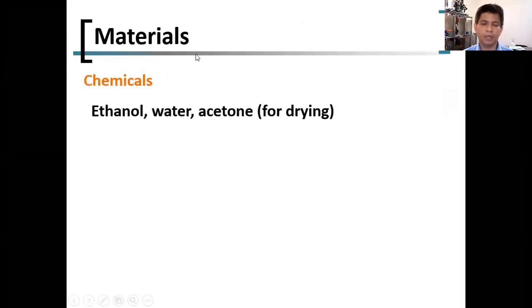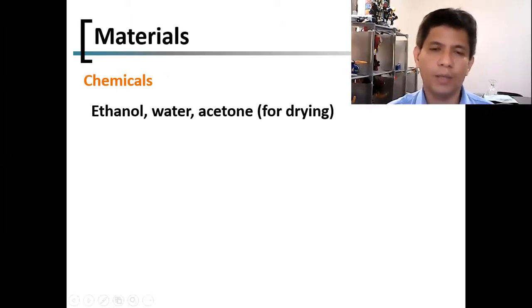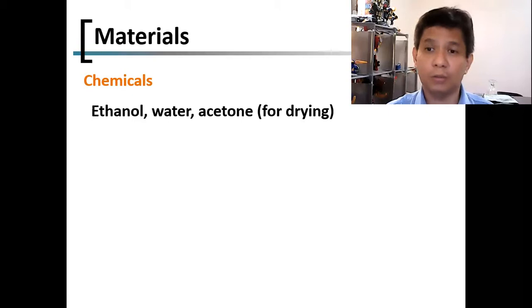Okay, so these are the materials. We're going to use ethanol and water, and then also acetone. This is used for cleaning the pycnometer, or for drying the Erlenmeyer flask. So these are the three chemicals. But basically, we're going to prepare an ethanol-water solution.